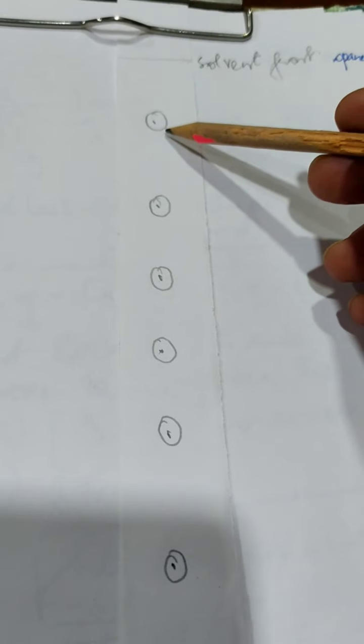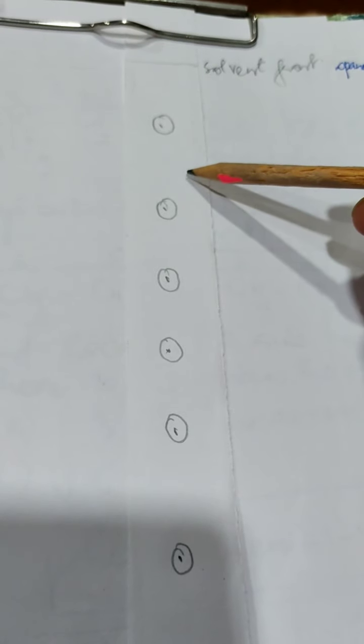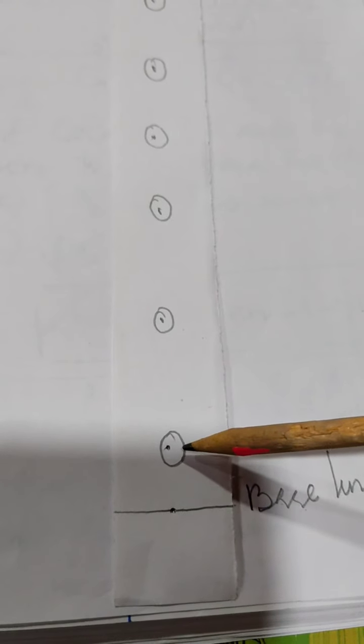This means this is the ingredient in the system which has not been held by the chromatogram, or the stationary phase, as much as these have been held. So this is the least held one. This ingredient here has been the most held one by the chromatogram, and all these others fall in the range between this one and this one.